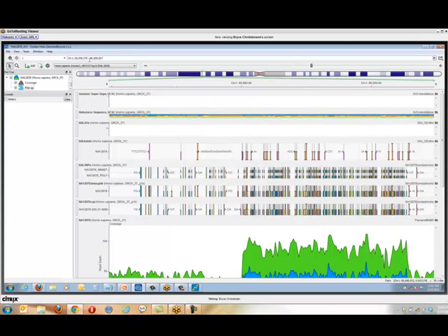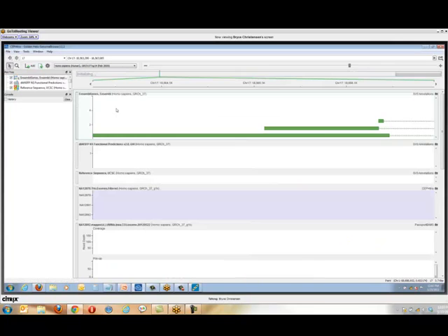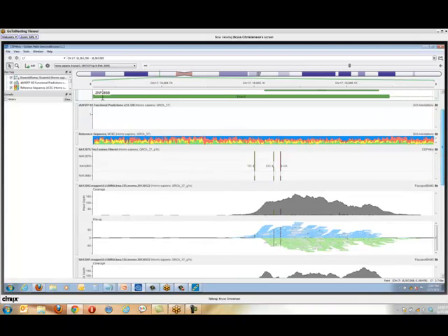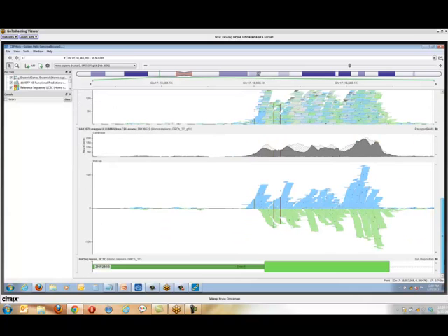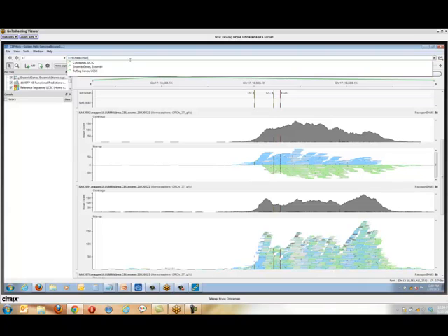So let's switch gears and just look at a few SNPs in a family trio and get an idea of what they should look like. So go back over to my project with this trio data. And here, what I have, and again, I'm having a hard time seeing my scroll bar. There it is. So I have the pileup data for parent, and child here. And the first one I want to look at is just a simple SNP that follows the recessive pattern.